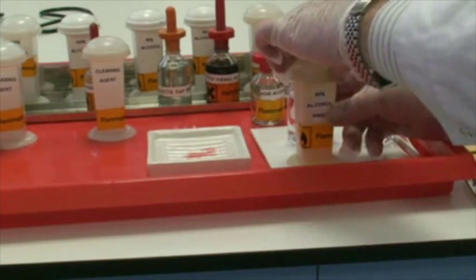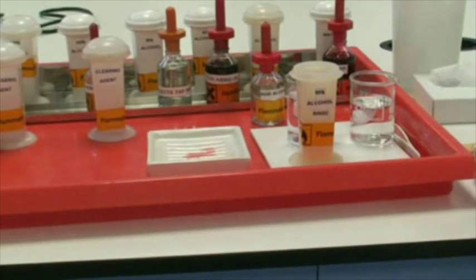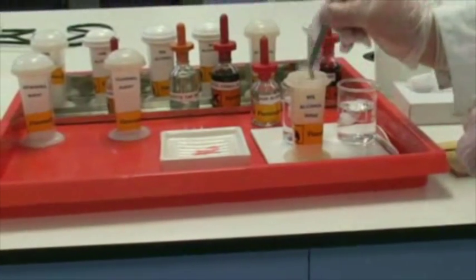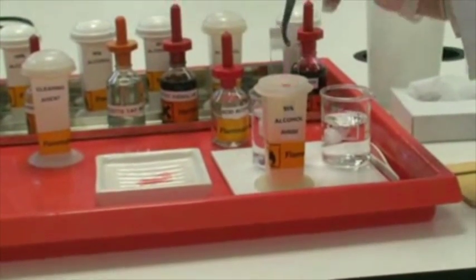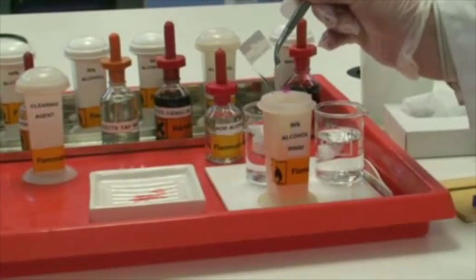I'm now going to lift up the lid and give it slight agitation to clear off the excess. You can see there we've got a slide which has now taken on the cytoplasmic as well as the nuclear stain.